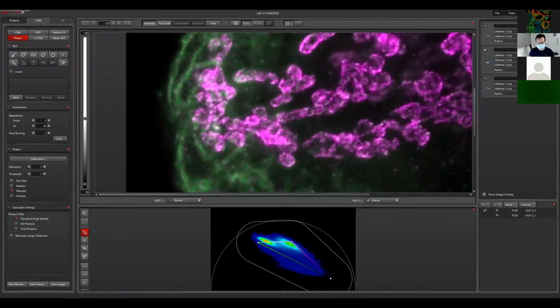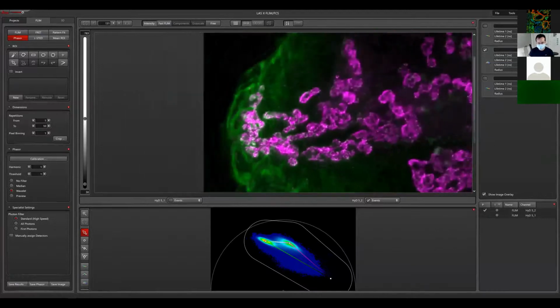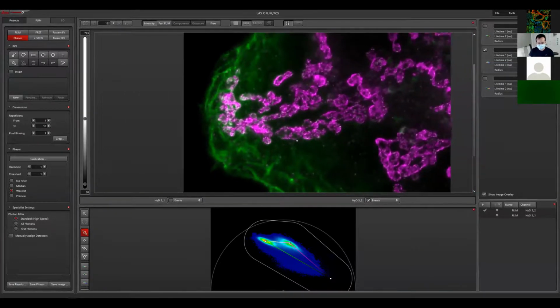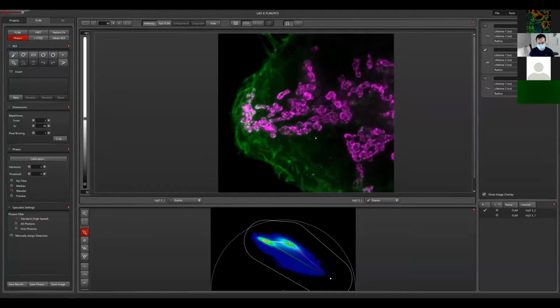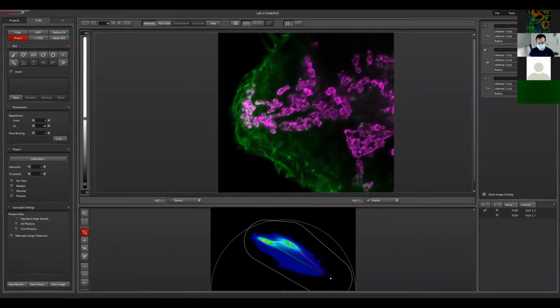However, I can say that if you go yourself to the Phasor, you can check it yourself. So you can always, the way we showed it now, me and Mariano, create this gradient yourself and then manually double check, just as a control, if you would like to have that, what is included actually in the automatic result and what not.